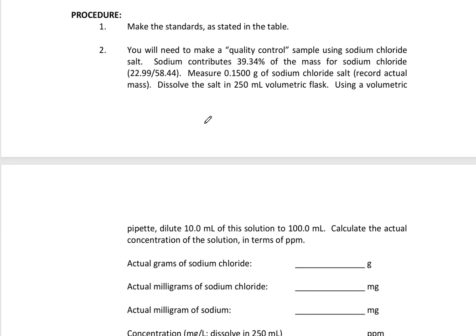What? What on earth is he talking about? Okay, well, I promise you this is not very complicated. This goes back to traditional CTC 150 standards and solutions, because this is a standard that we are making, and we're making the standard from a salt.